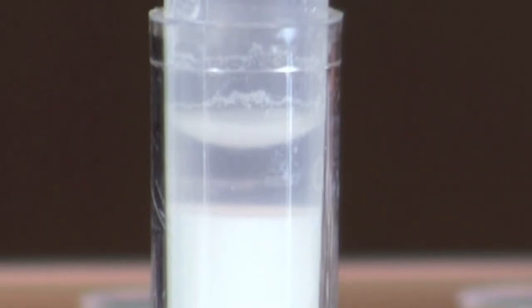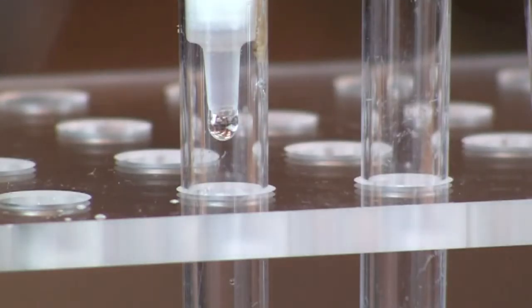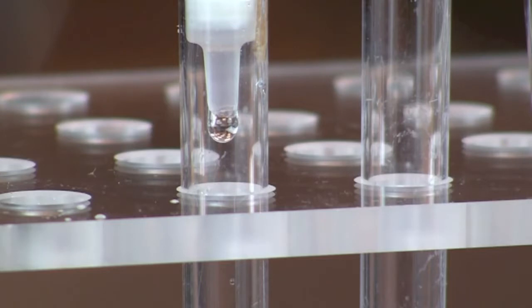Allow the column to drain the storage buffer in collection tube number 1, until the bottom of the meniscus is 1 to 2 millimeters from the surface of the resin.